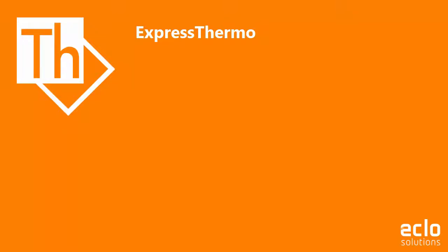Welcome. This tutorial will show you how to use the MKT calculation module from ExpressThermo for Windows 10. Note that this is an add-on module, which is available through purchase.